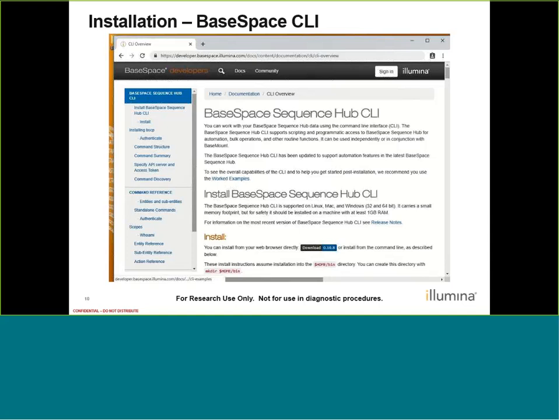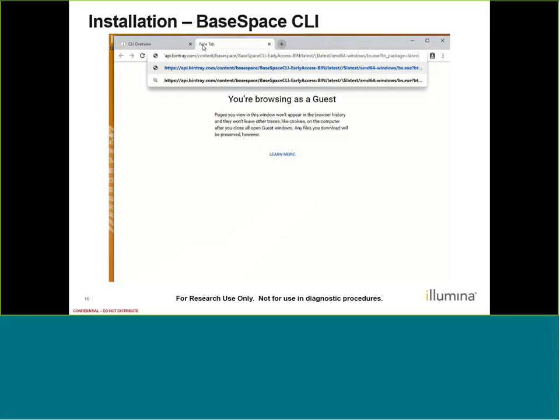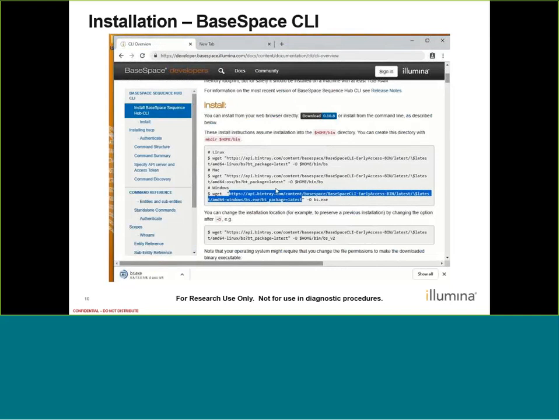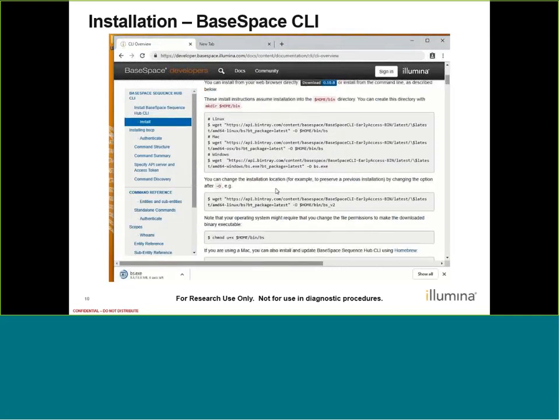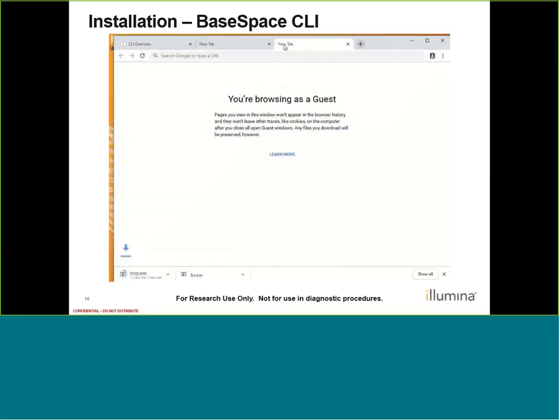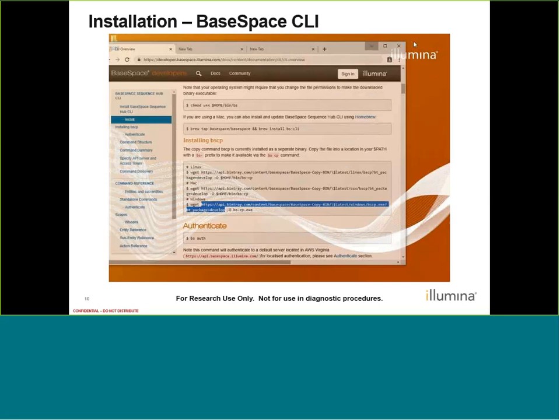Since we're going to focus on this alternate installation, I'm going to grab this URL here under the Windows command and paste it into my browser, and my download started. That grabs the BS script. Let me go ahead and grab the BSCP script as well — I'm going to copy this URL and paste it in, and that download is going to start as well. Okay, so it looks like my download is completed.